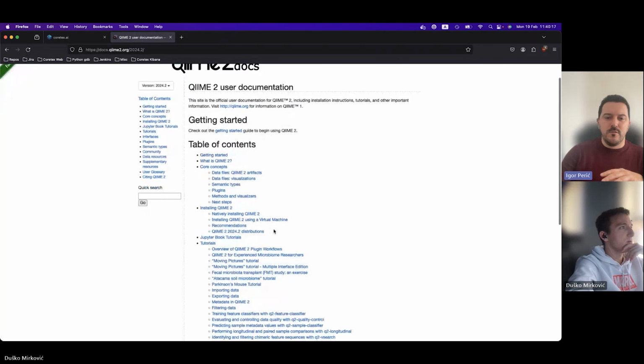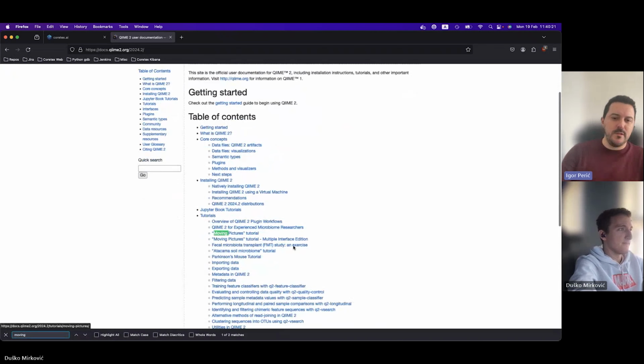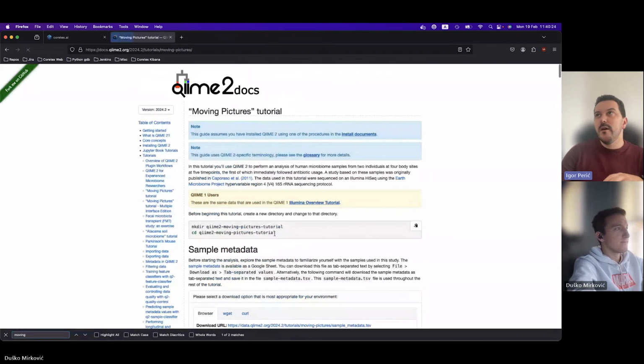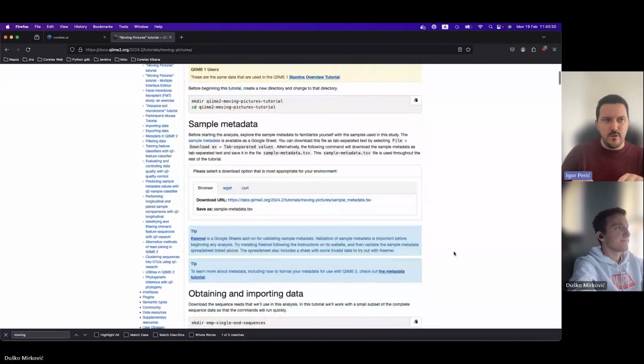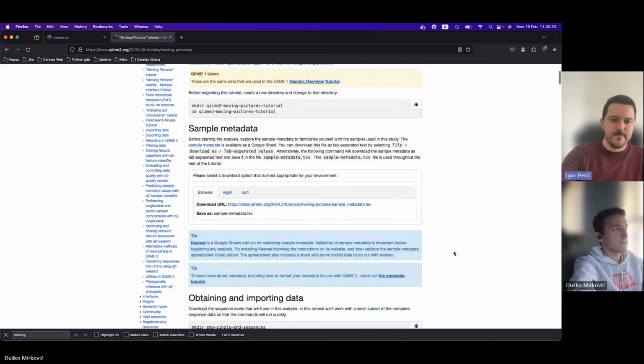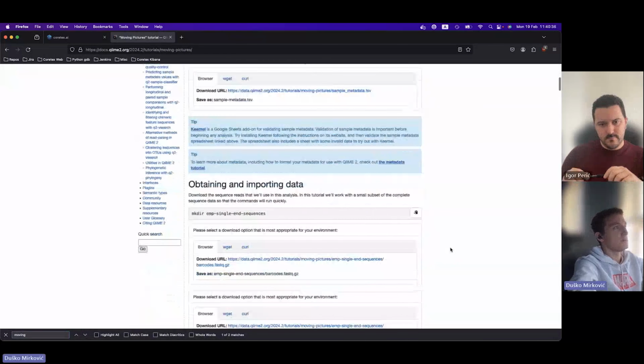So this tool can be used as an independent tool completely, but we're gonna show how it's wrapped into Coretex, so you can do stuff like schedule and organize multiple experiments in QIIME versus just manually running them one after another. Yeah, and we are gonna need multiple files from this website.